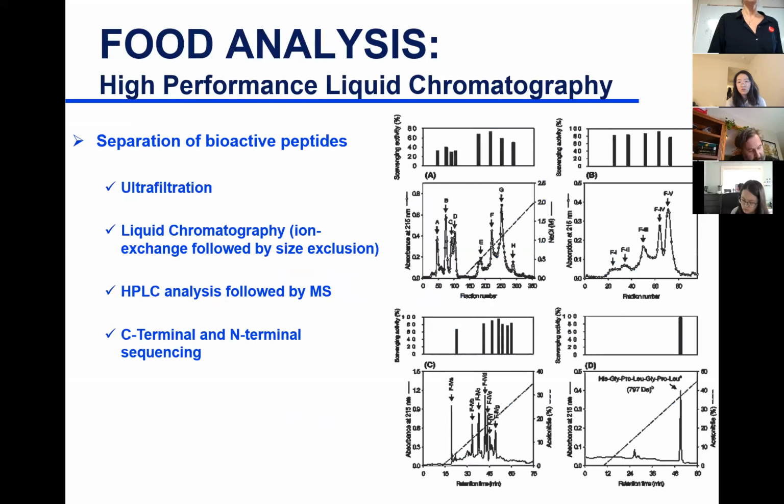All right, so the very last thing, I have a few minutes. Here is an example where we use high performance liquid chromatography in multiple dimensions. So 3D here. Let me just close out of this chat for a second so that everybody can see.